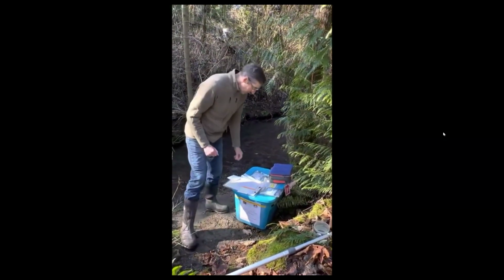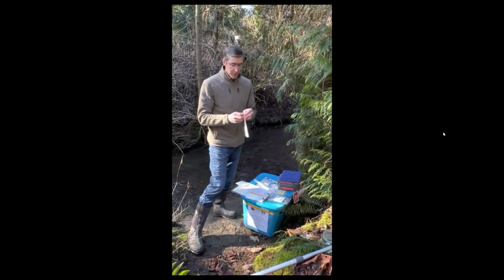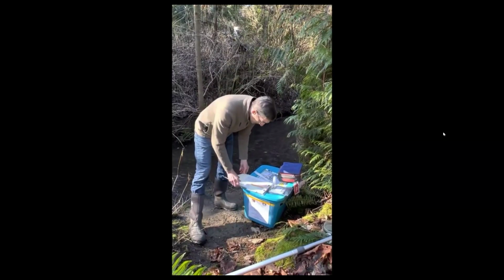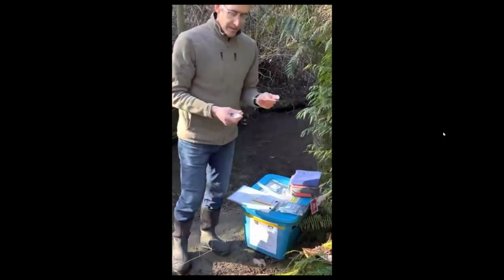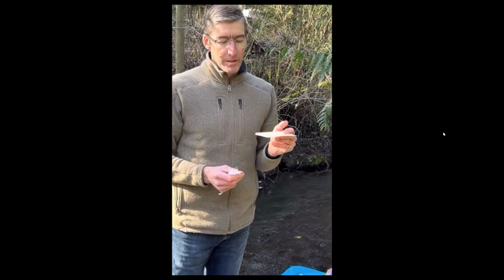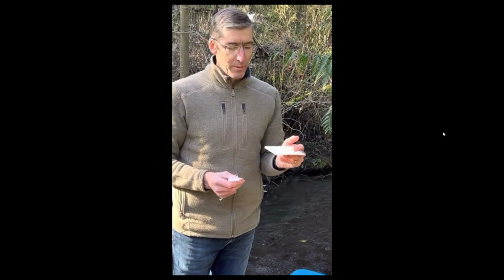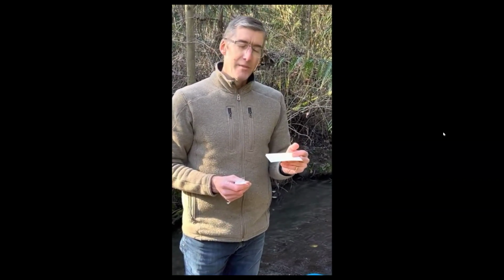So then what I like to do is get my pipette ready. For this purpose, we'll do a 3 milliliter pipette, and we'll do the 3 milliliter R card. Now, if you watch the Roth training videos, they recommend that they either use sterile forceps or sterile gloves for opening this. What we found in practice in the field is that that can be a bit difficult for people.